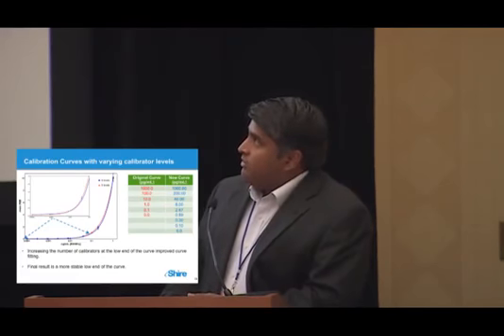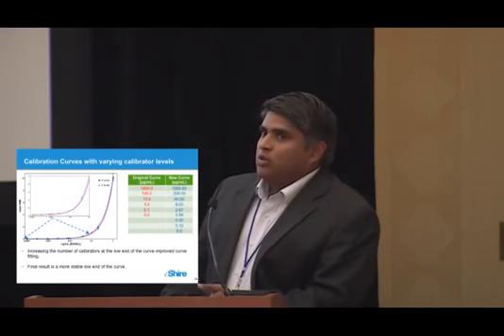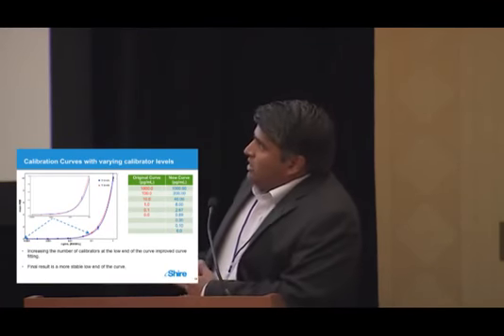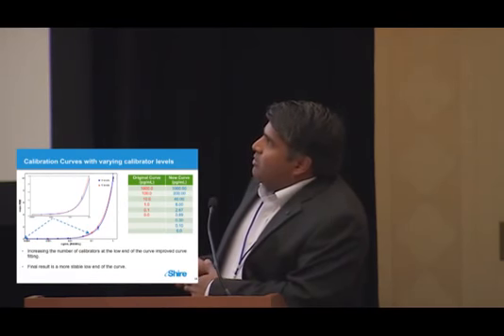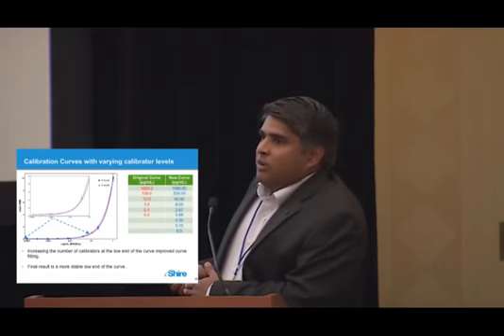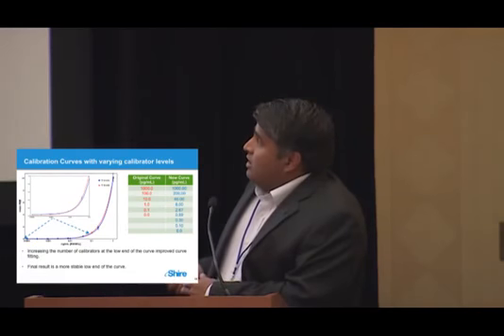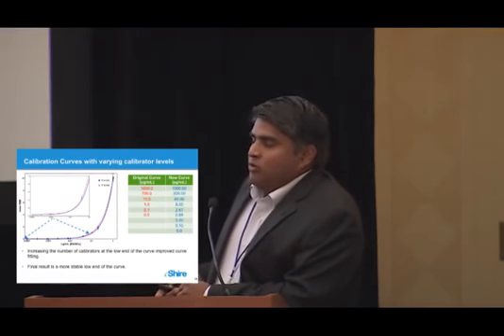So we have an assay where the quantification looks good. It looks very sensitive. Next step is to qualify or validate this assay so we can use it for either non-clinical or clinical studies. Here I wanted to mention that in the field of biomarkers, there's a white paper published in 2006 by Lee et al. We still use this paper because FDA doesn't have guidance for biomarker validations. So this paper explains all the steps that we have to use for validating an assay.